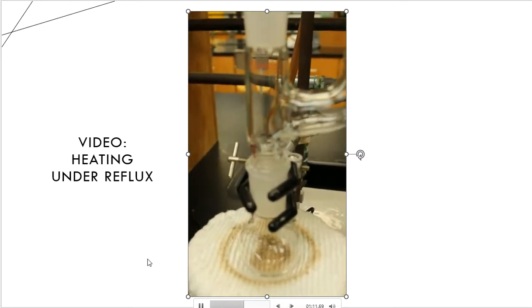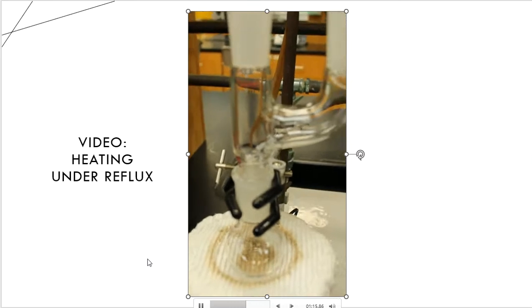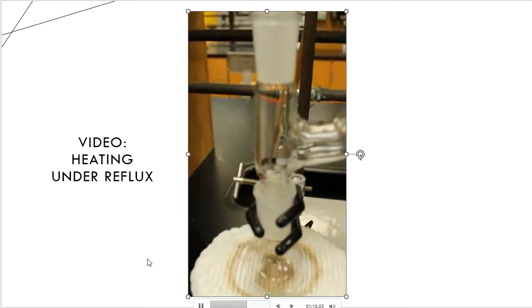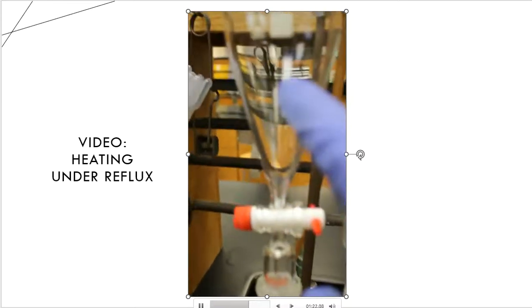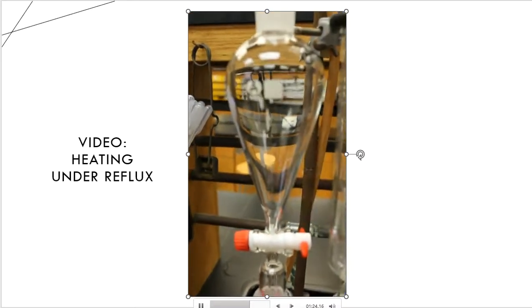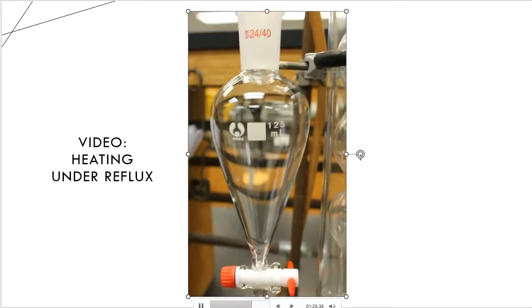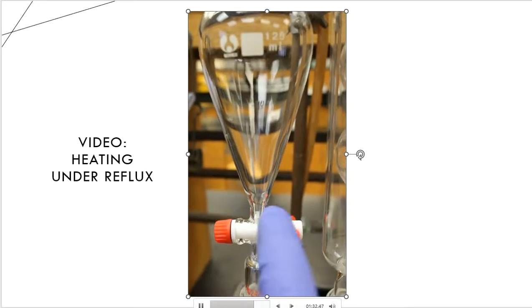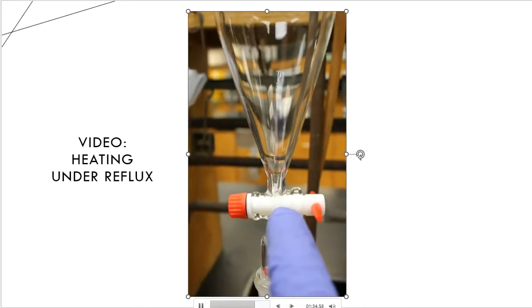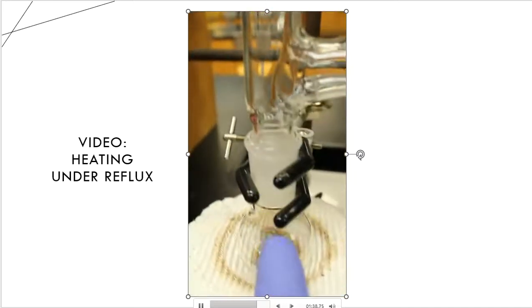However, during this heating process, I'm going to have to add things. And this is why it's called a reflux with addition. So what I'm going to add is actually going to be here in the separatory funnel. So I'm going to put my reagent that I need into the separatory funnel. It's probably going to be a liquid. I'm going to open up the stopcock here, and I'm going to allow that liquid to drip very slowly down below into the boiling flask.